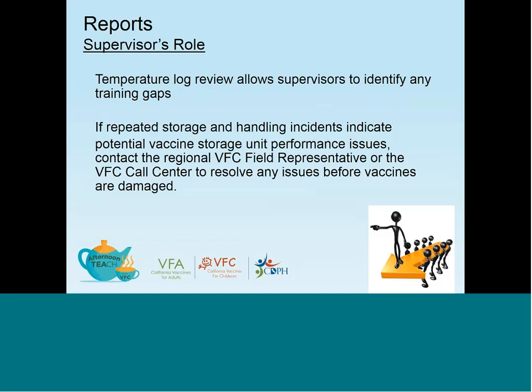For additional guidance, refer to the Monitoring Storage Unit Temperatures lesson for more training. If repeated storage and handling incidents occur or potential vaccine storage unit performance issues arise, contact the regional VFC field representative or the VFC call center to resolve any issues before vaccines are damaged.